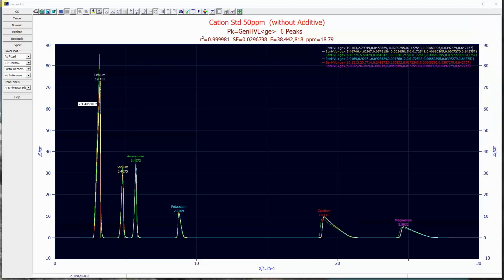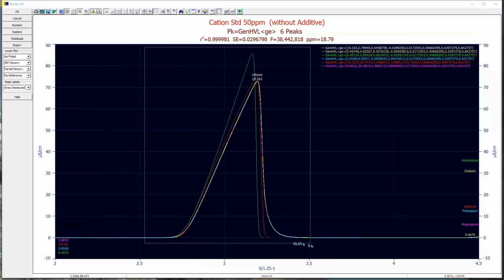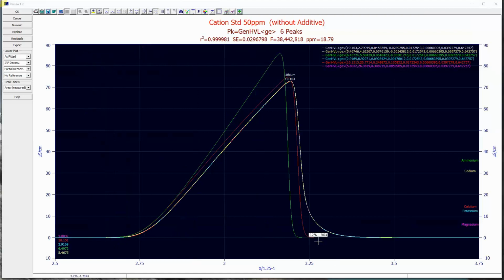Next, we'll look at the highest concentration of this most fronted peak. Here we see a much more pronounced difference between the red peak without the IRF and the green HVL. The peak without the IRF shows a strong curvature, where such cannot exist in the HVL. You can see the curvature in the observed data, and this is not an effect that an IRF can model. Only the asymmetry in a third moment bearing generalized chromatographic model can do this.